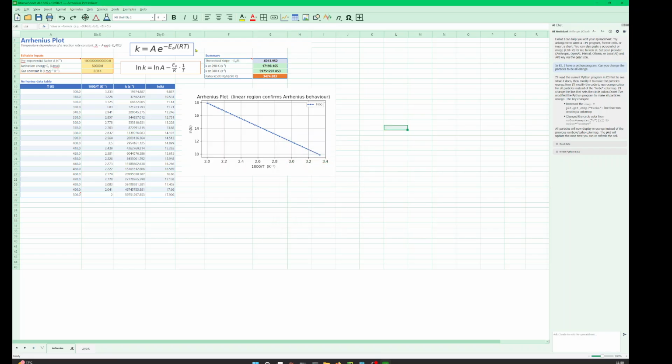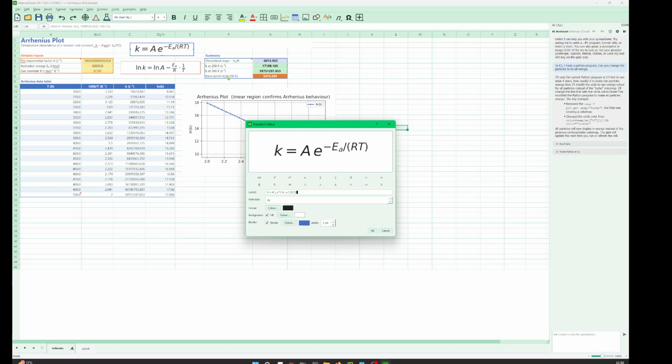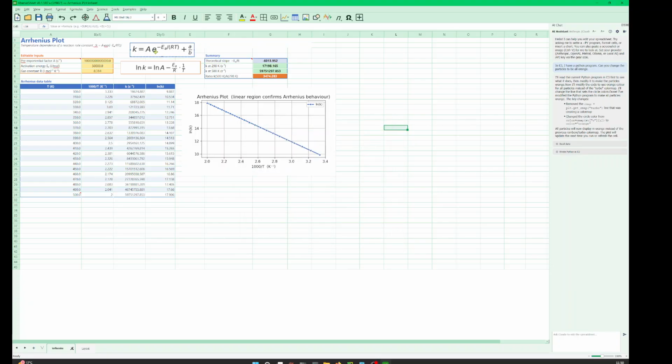So this is an equation and that looks like it's a picture, but actually it's not. It's editable. You can add, for example, a plus in here. You will see the plus, and it looks like it's an error, but you can just add something in the fraction. So it's a LaTeX-type equation, and now you have it written like this.